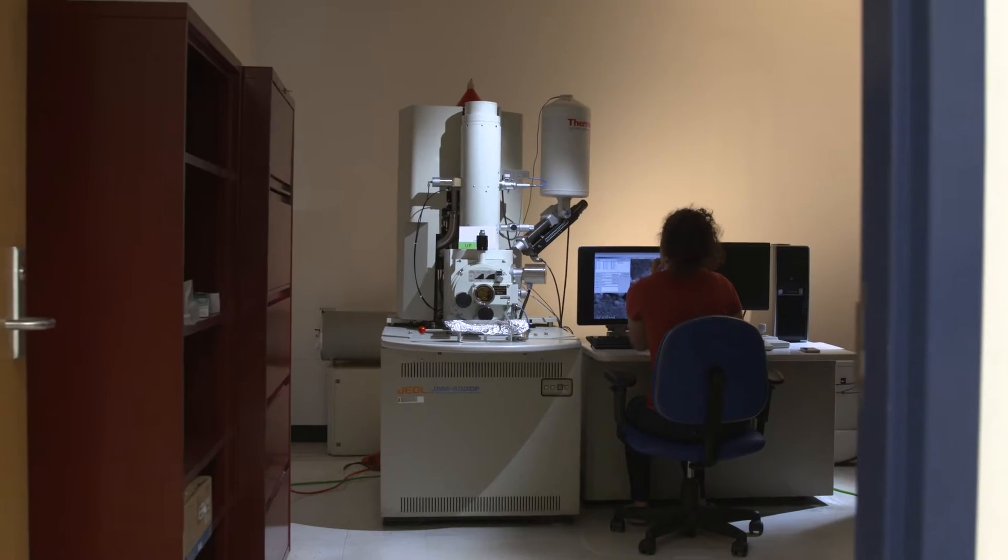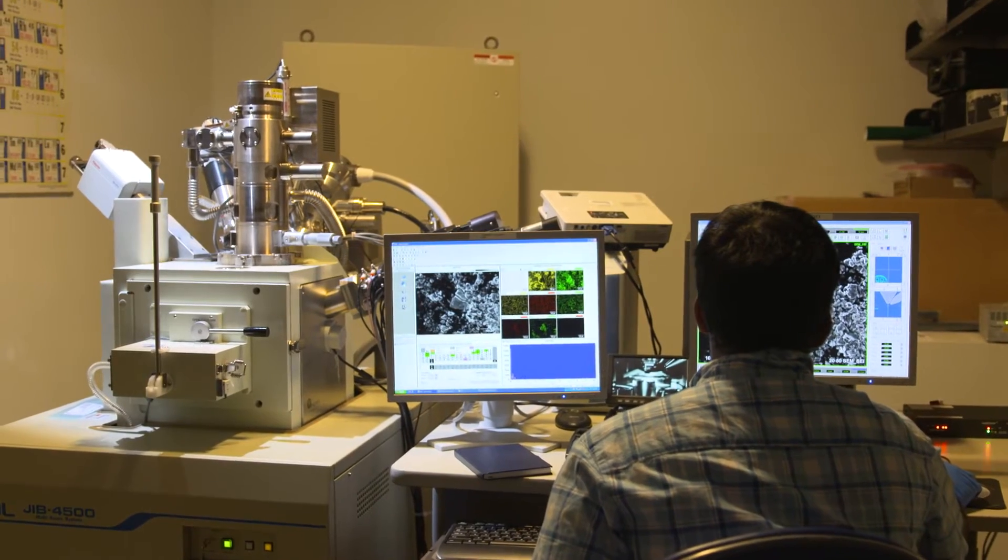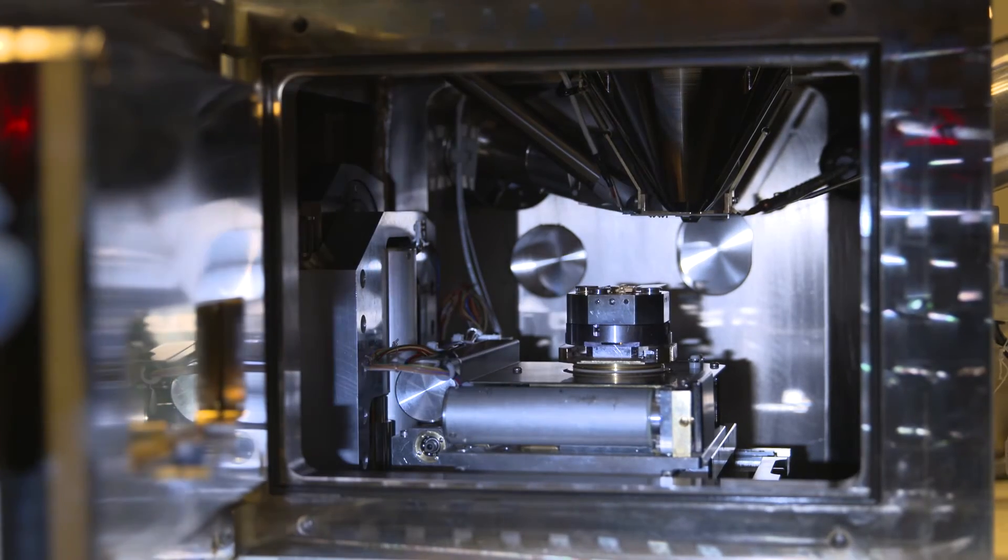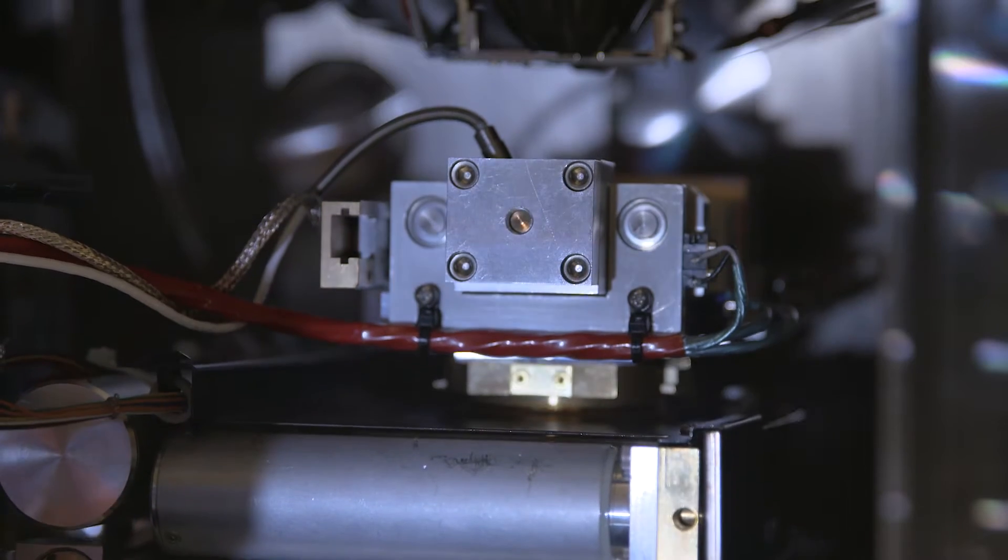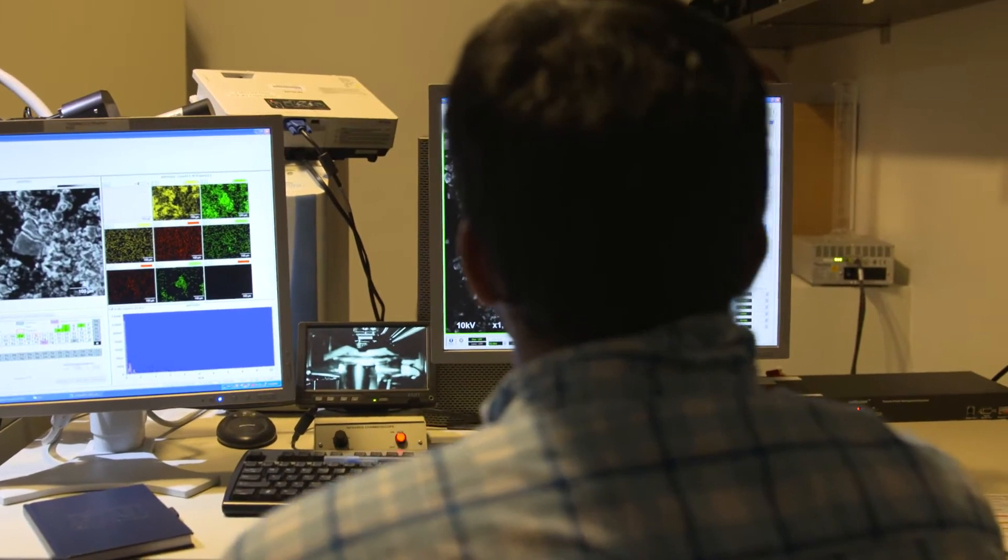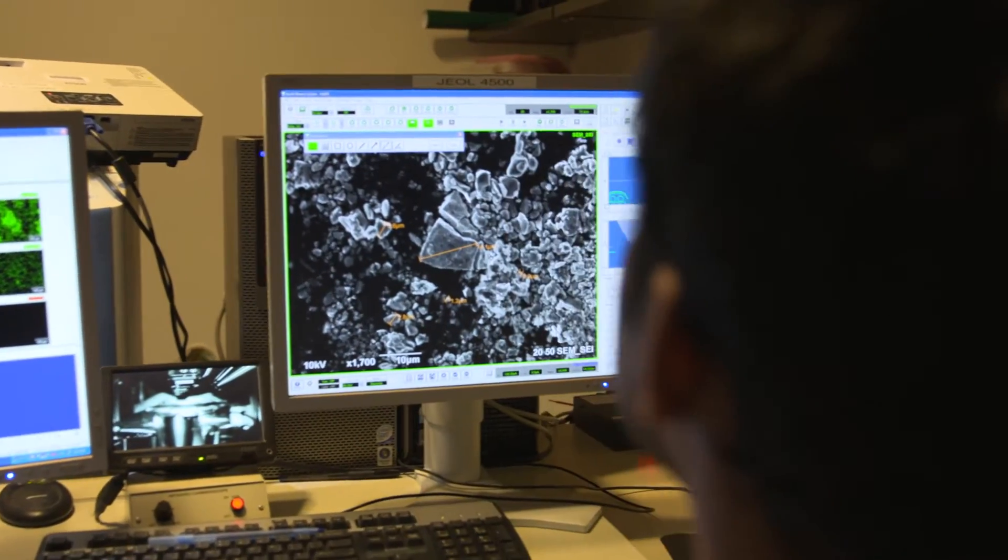The analytical suite is home to four electron microscopes. Our focused ion beam can be used for nano scale sample manufacturing, site-specific compositional analysis and high resolution imaging.